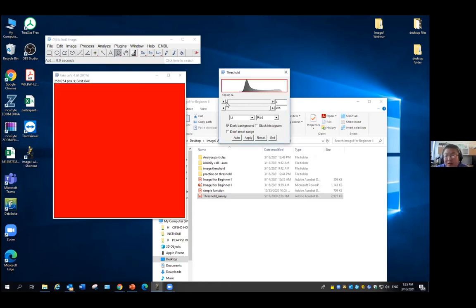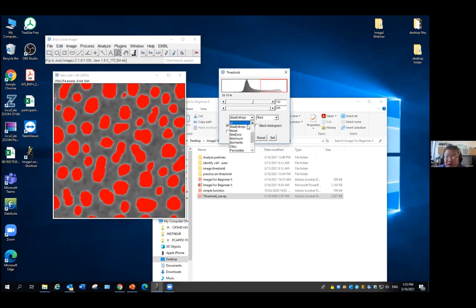Now if I still use 115, it's kind of a no, because the intensity goes up and we actually have a very high background in this case. So 115 won't work. It worked for the previous image, but it doesn't work for this one. But if I actually use Lee, now it goes to 146. It basically raises by about 30, almost the same as I artificially raised the background.